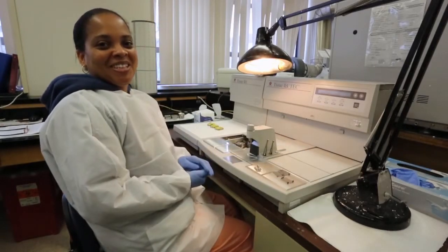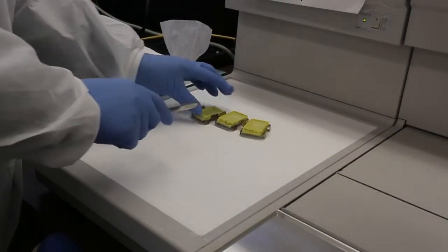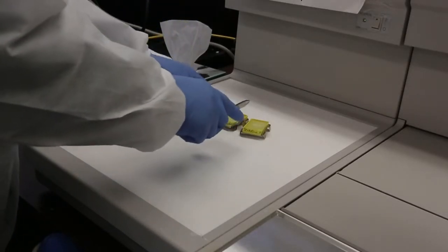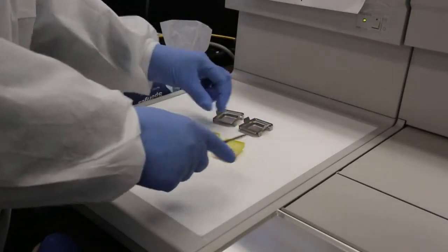We'll just wait until that hardens and then you'll see what it looks like after that. Now I'm going to take the blocks that are cold and just pop them out of the molds — that's one, two, three.